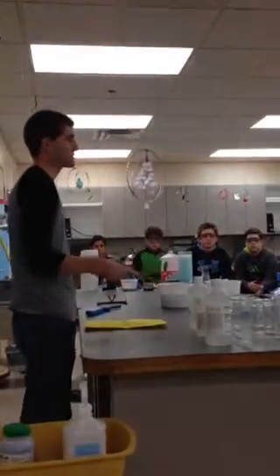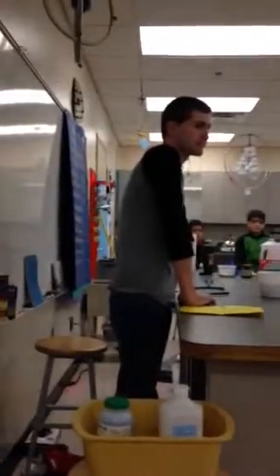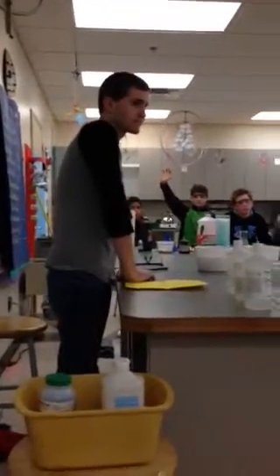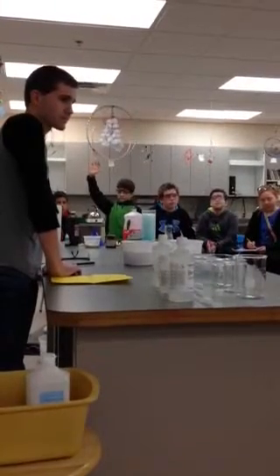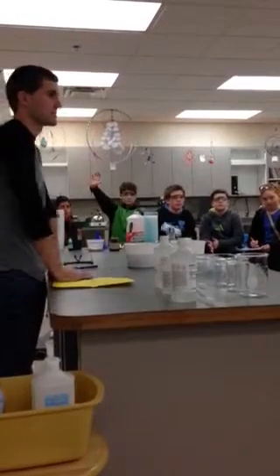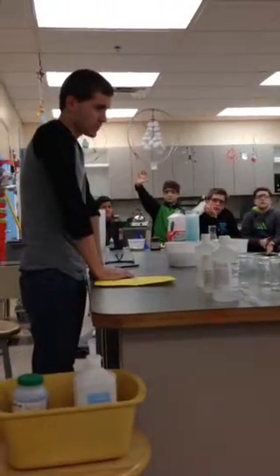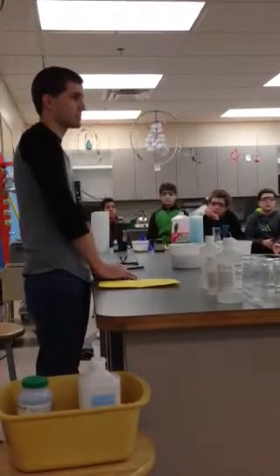Number 2. Thoughts. Go ahead. Me? Yep. I said a physical. Why do you think physical? Because you poured something onto it. And it wouldn't have caught fire green if you wouldn't have poured that on. Okay. Chemical because it changed color. It did change color. The chemical change is not really with the color.